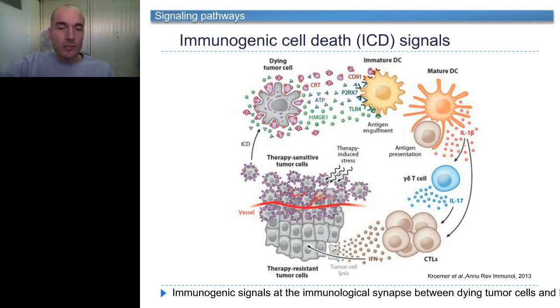These cells undergo a heavy ER stress, they undergo autophagy, and in the end they will suffer and die. These three signals together lead to the exposure and release of calreticulin on the surface of the dying cells, to the active autophagy-dependent secretion of ATP, and to the release of HMGB1 at late stages of apoptosis when the cellular membranes are disintegrated.